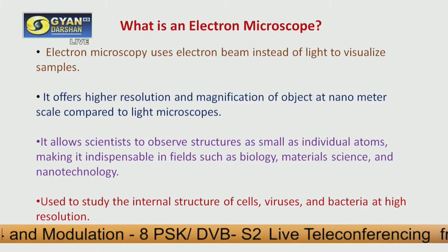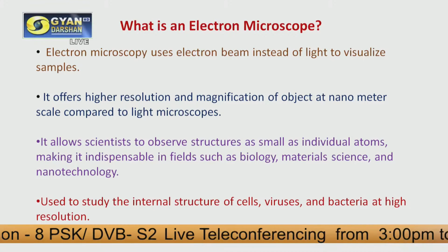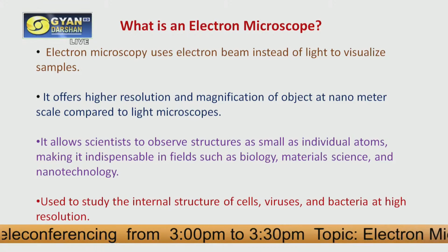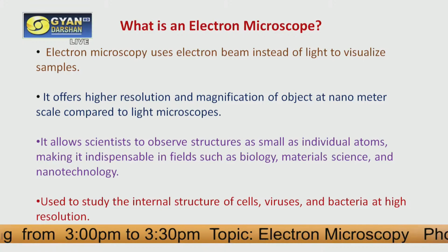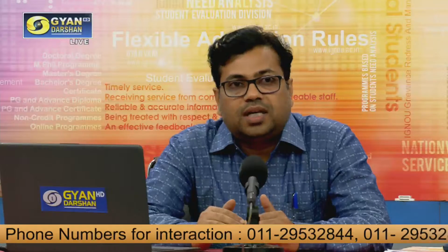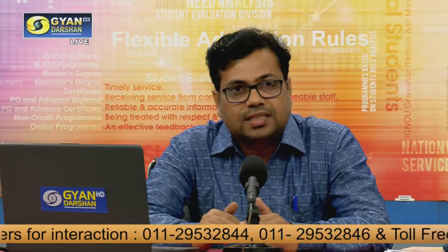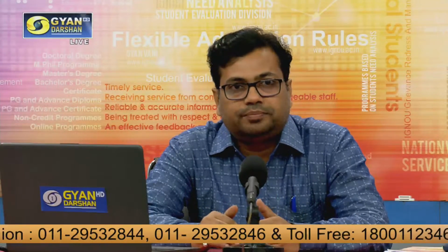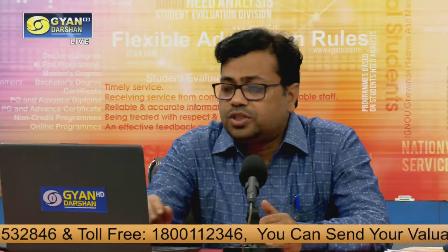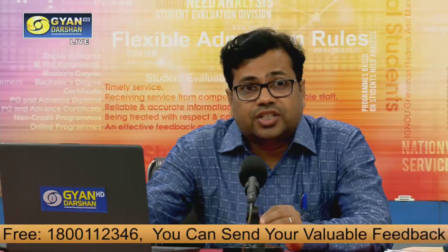Electron microscopy has wide scope in every field of scientific study, like engineering, medicine, toxicology, and clinical biochemistry. It is used across a wide spectrum of applications in the research field. If we want to study cellular structures like subcellular organelles such as mitochondria, endoplasmic reticulum, and nucleus, we need an electron microscope to study these structures at the molecular level.